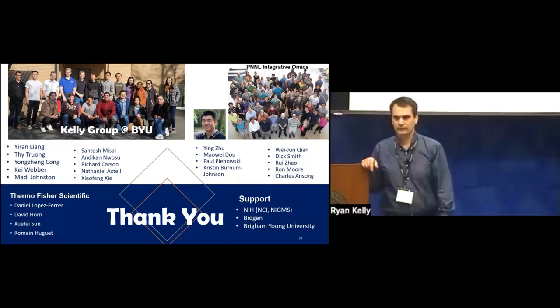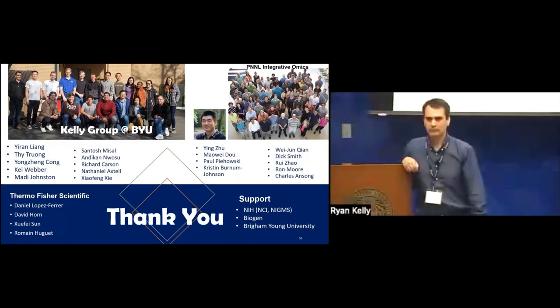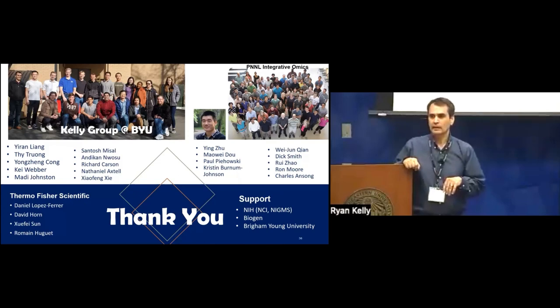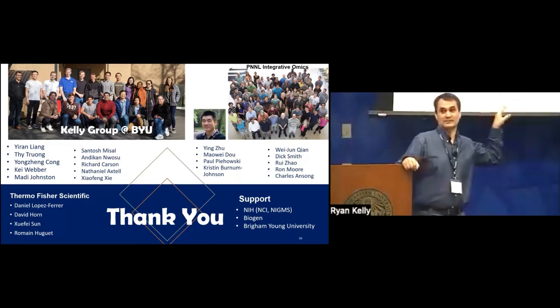Thank you very much. Great talk. I was wondering, you showed some results from 0.2 nanogram of digest. Do you know what the results would be if you start from entire proteins of the same amount, and then the results if you start from the cell? The amount is the same, but the starting point is not the same. The result you showed is directly 0.2 nanogram of digest of protein. If you do exactly the same by starting with the entire protein, so you digest it, starting with 0.2 nanogram of protein, and then if you start with the entire cell, but the same amount, what is the impact on the final results and the quality?